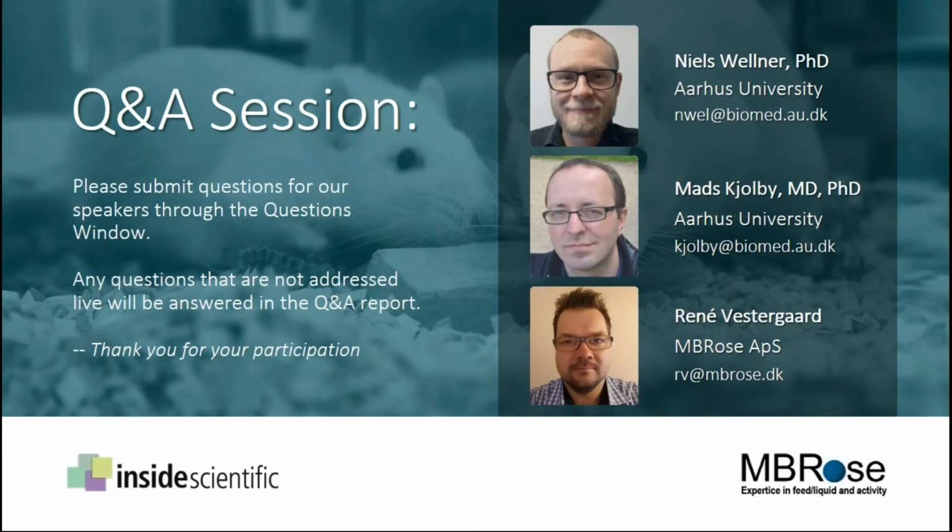A question here from Thomas in the United States is, how does the system handle animals that hoard food? Mads and Niels, may I start with you? Is that a question that you can answer? Yeah, sure. It's not really possible for the animals to do this. The design is that they can't take a portion of food and bring it back to the cage, because this would destroy the measurements. If you keep ad-lib food in the cage and measure with two bottles, for instance, then of course they will be able to do it through the cage lid, but not if you monitor the food intake in the channels.